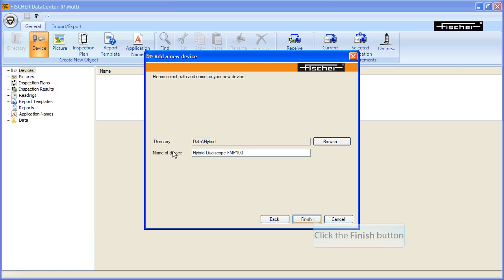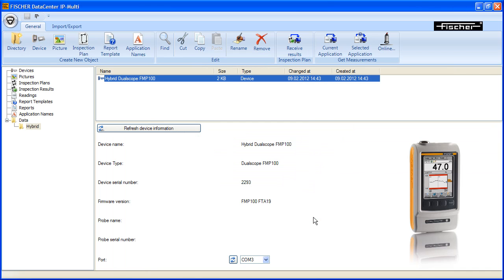Click the Finish button to confirm the entry. The Fischer device has been set up successfully and it is now ready for data exchange.